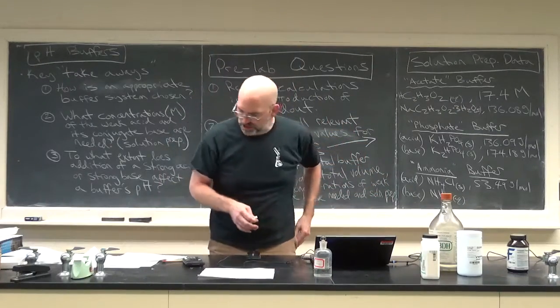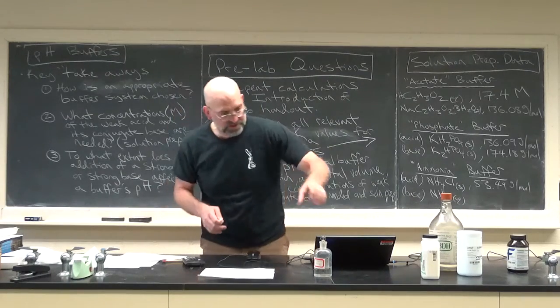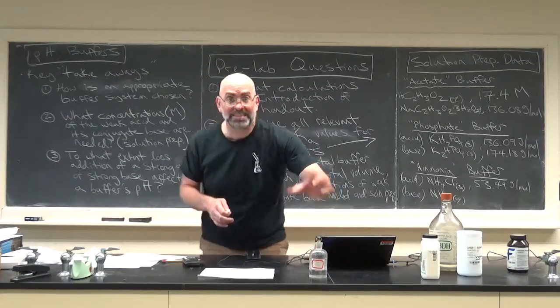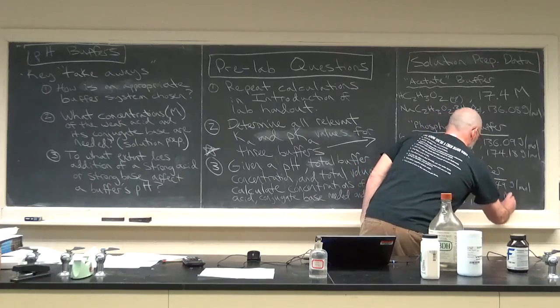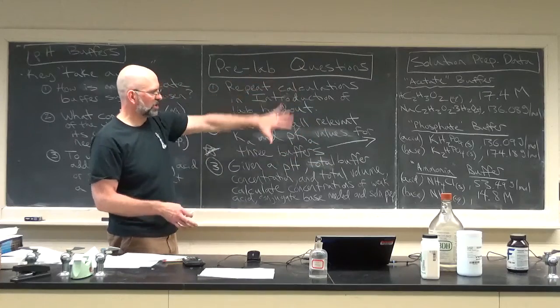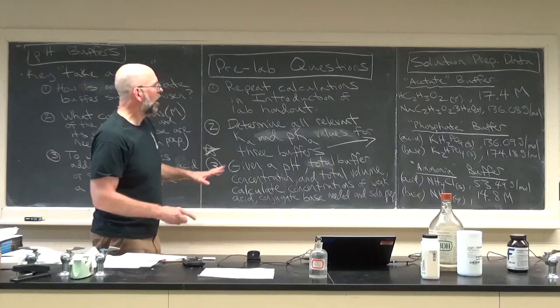And the concentration of the ammonia, you can see it's a solution. It's also very concentrated, 14.8. So the molarity is a 14.8 molar solution. So you need all of that data to do your solution prep calculations, which I'm not going to go over in their entirety.